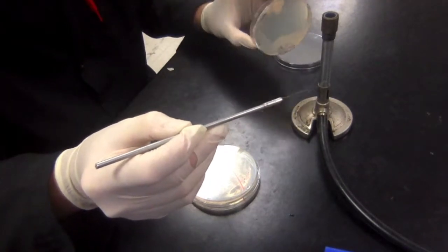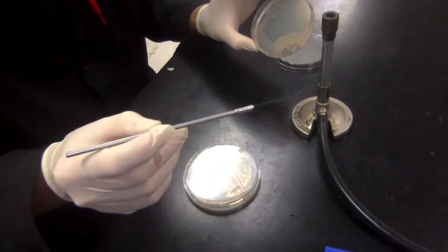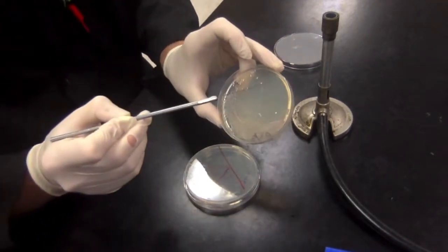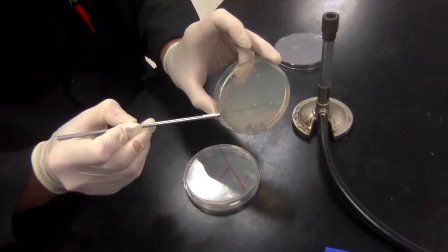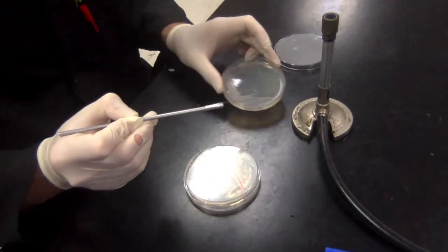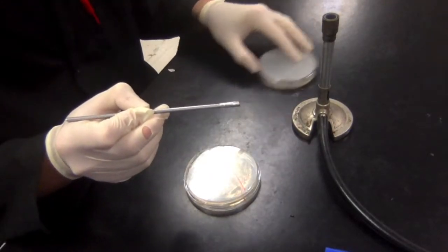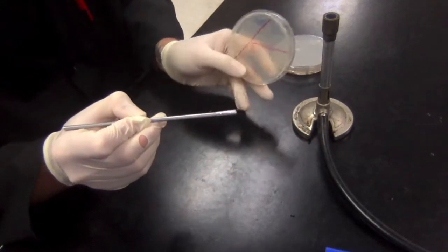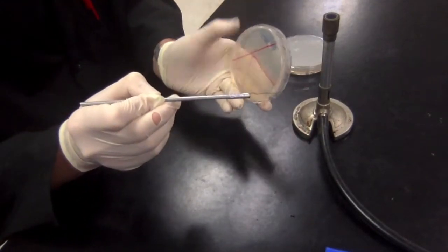Now I have my plate with pre-existing bacterial growth. I'm going to pick one individual colony and just barely touch it with the loop — it doesn't take much. Now I'm going to take our K plate and start in the left section of the letter.